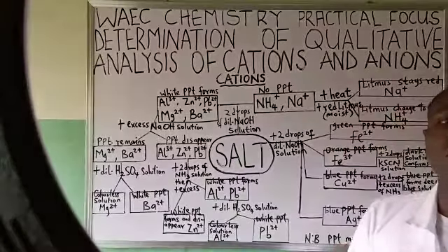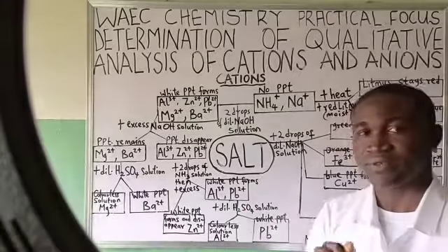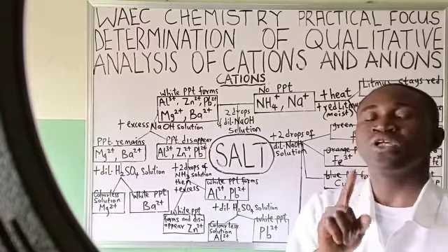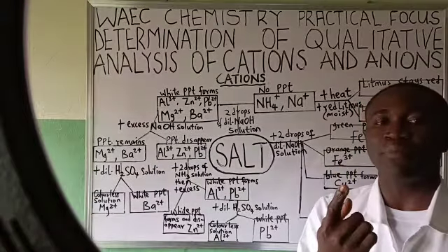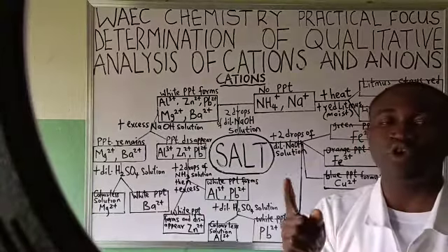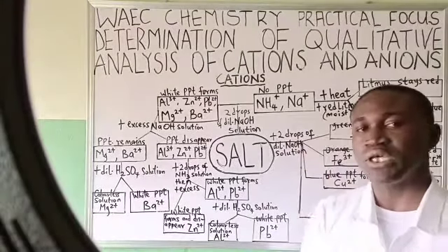Okay? Then we go for solubility in water. Solubility test. That solubility test is very helpful. With the solubility test, it will help you to know if the salt contains a mixture of soluble salt and insoluble salt. See how we do it.